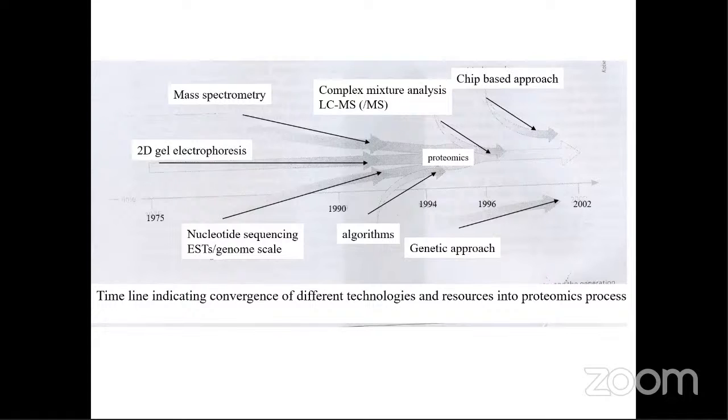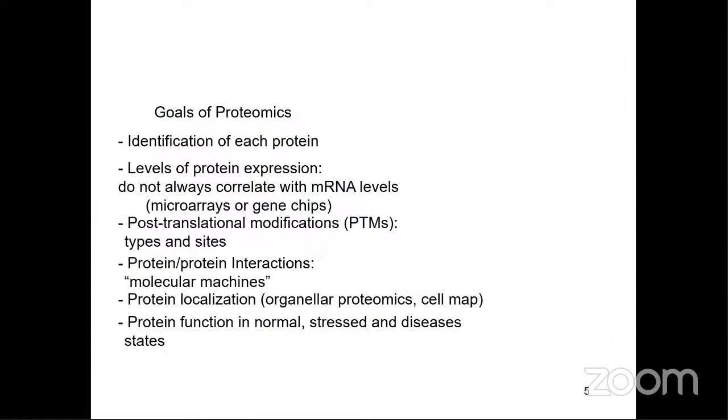I will show you some of them, but not many of them. So the time frame went as the proteomics research really took off. The same happened with the instruments: the mass spec, the LC-MS, chip-based approaches, and so on. So there is a convergence of different technologies and resources into proteomics. So what's the goal of proteomics?